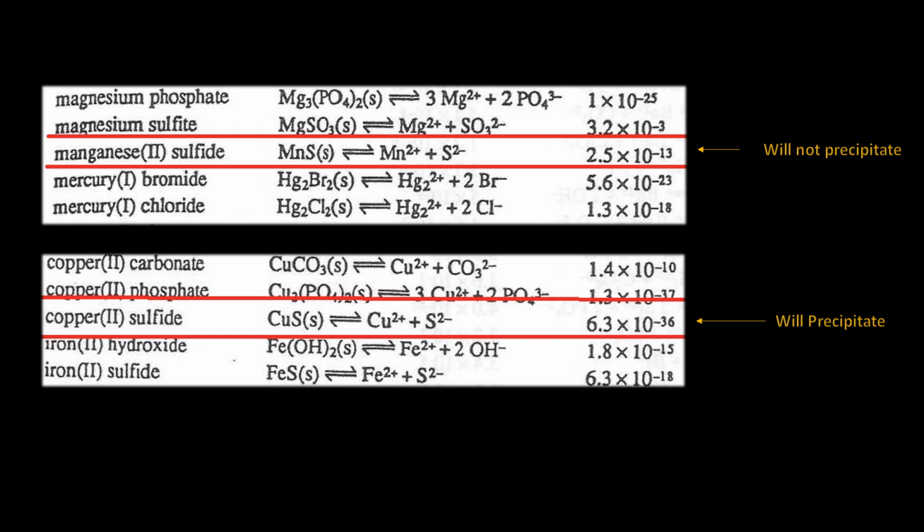The classifications associated with the groups, being chlorides, sulfides, hydroxides, and carbonates, are based on the formation, that is, the precipitated products with the metallic ions in various pH conditions, being either acidic, basic, or neutral. They are also based on the Ksp value. This will be discussed in a later presentation within this series, but for now, let's just state that any Ksp value of a product that is less than another will be able to precipitate.